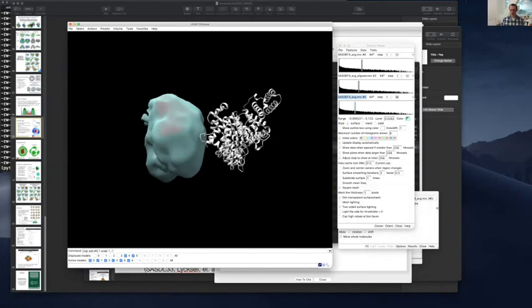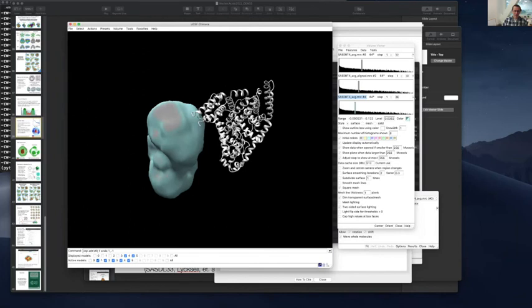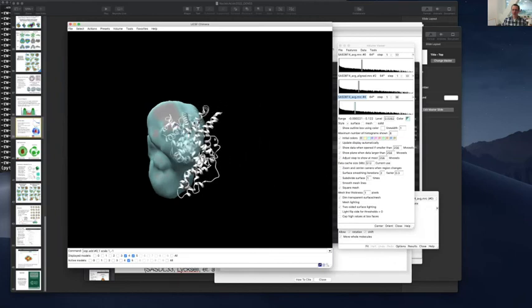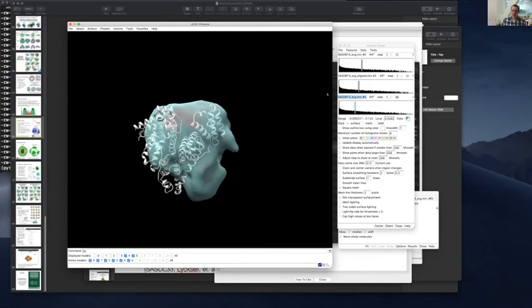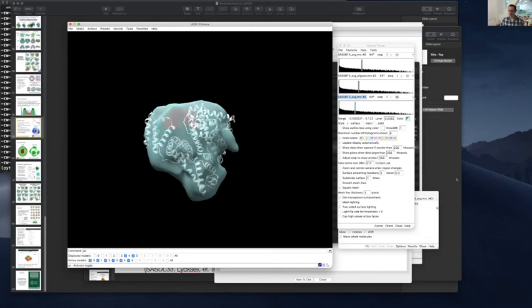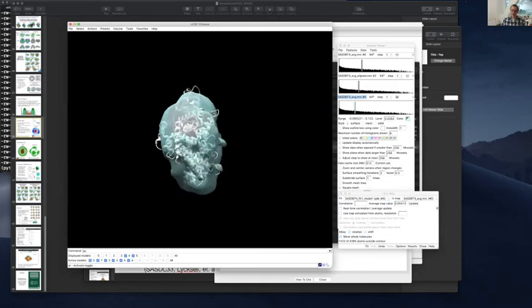And now what I kind of want to do is first get it in the rough position. So if I deselect all the other models to be active, and then I can move this model around. Okay, so I kind of just need it in a rough idea of where it's sort of aligned, right? That's rough, right? And then maybe I want to rotate a little bit, make it look like it's there, something like that. And then we can come over here and we just click fit, and it just fits it. All right, now we get a nice fit.